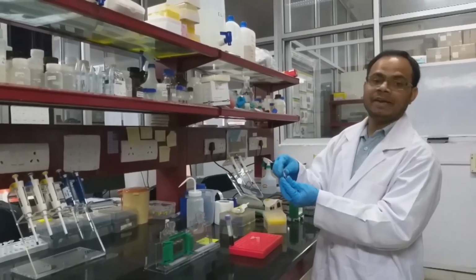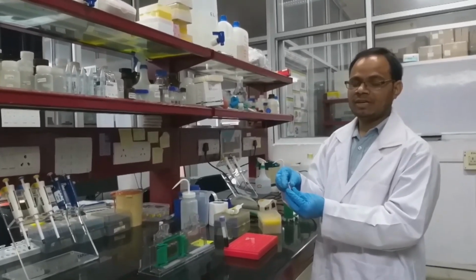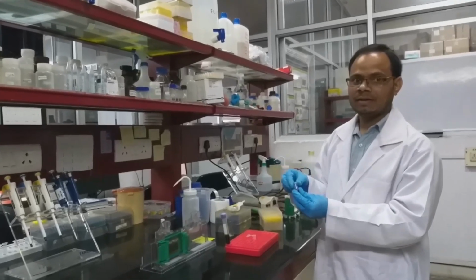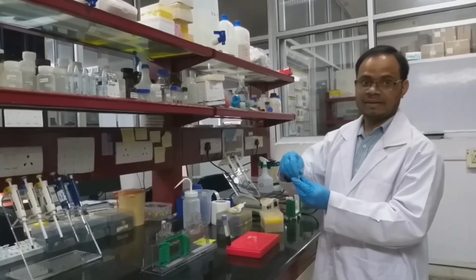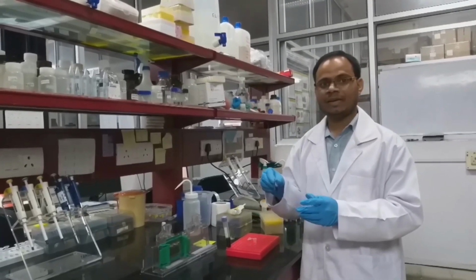Then we have to heat it for 3 minutes at 100 degrees Celsius, so that all the polypeptide chains, dimers, or any multimers that are present will break down and we can see a nice band. So I am going to heat this at 100 degrees Celsius for 3 minutes.